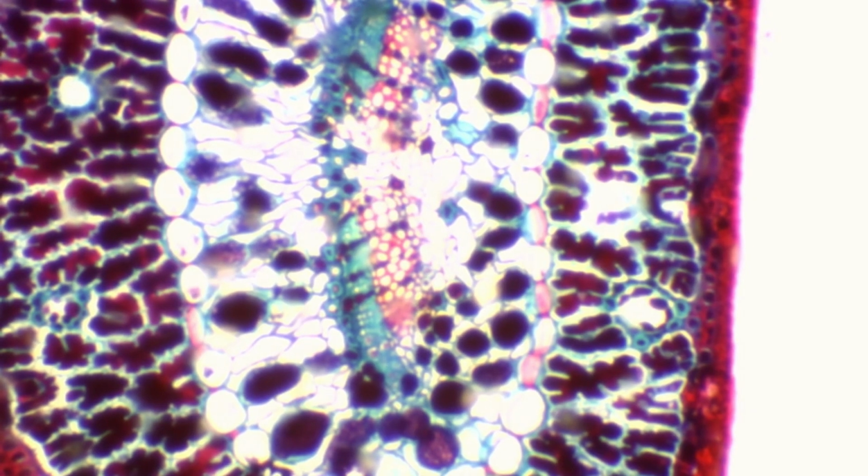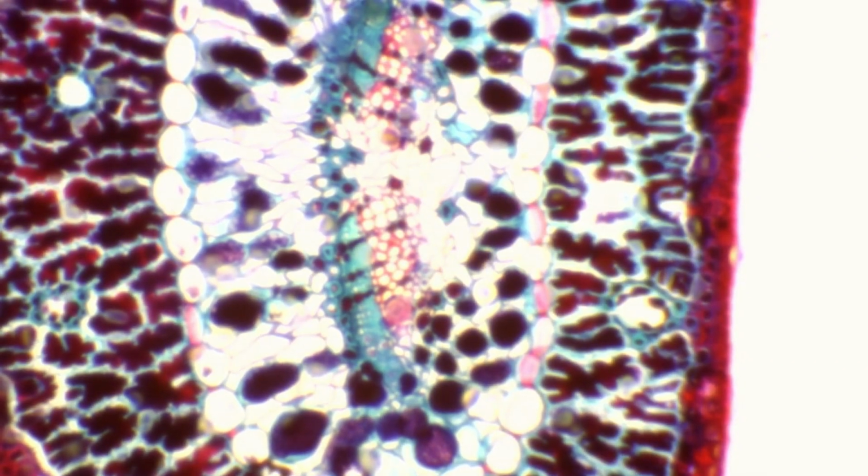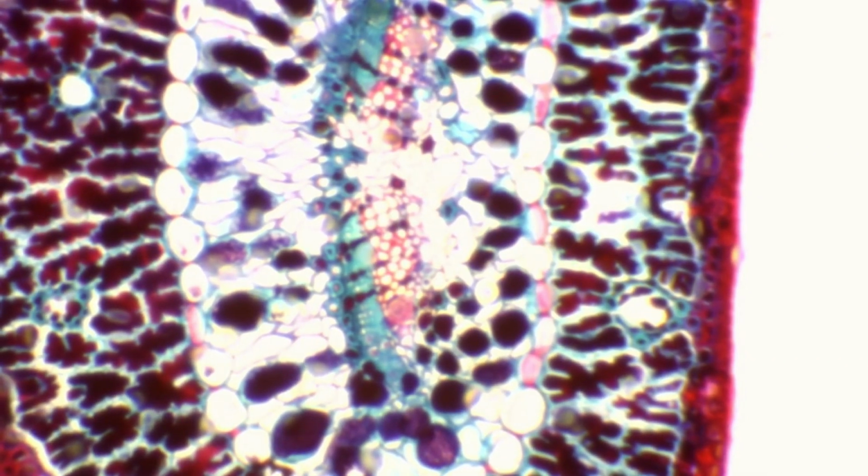They're often at the surface of the pine needle, and they're often recessed in pits. Under high magnification, you can see these pits as darker spots or lines. And this position helps minimize moisture loss.